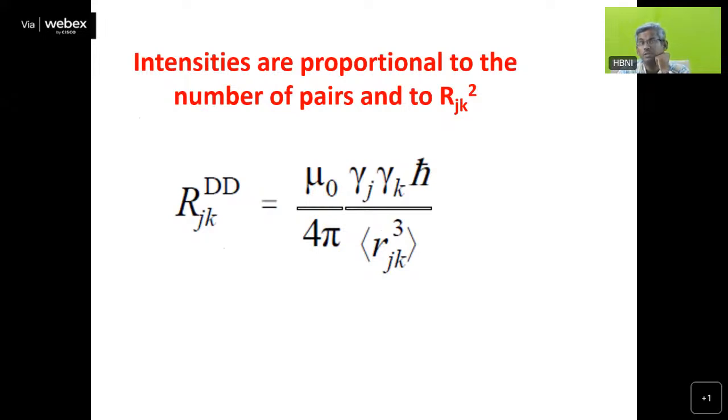Off diagonal peaks, if you measure the intensity, you can always calculate the distance between Q2 or the distance between the Q2 and Q1 structural units in glasses. So that is related to dipole-dipole coupling also, but that alone will not do, this has to be confirmed with some ab initio calculations also, and only then can we predict the geometry. From the distance information alone, you may not be able to predict the geometry. We need to support it from theory.